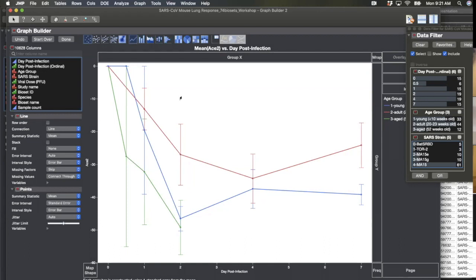So on the y-axis, the numbers are just relative. Right. Normalized relative decrease in expression. Yes, correct. And again, remember, this is a decrease compared to controls. So we're not looking at the raw data. What we're looking at are the ranked change in gene expression. Right. So if this one was infected and the infected. Correct.